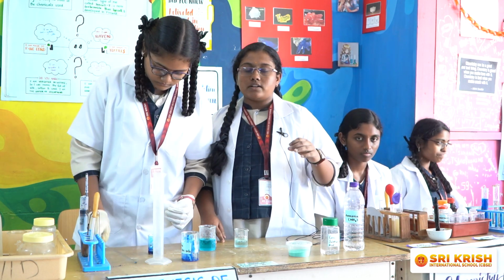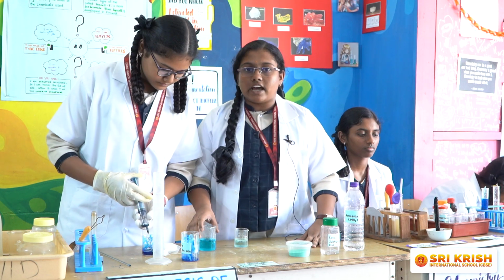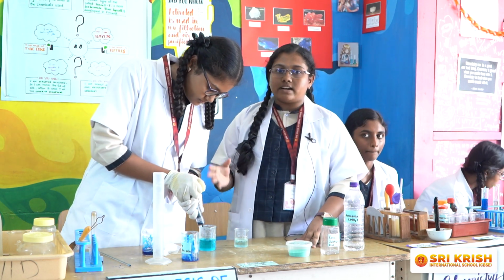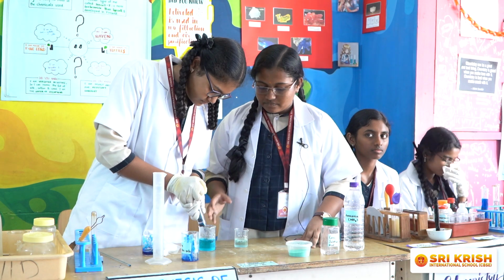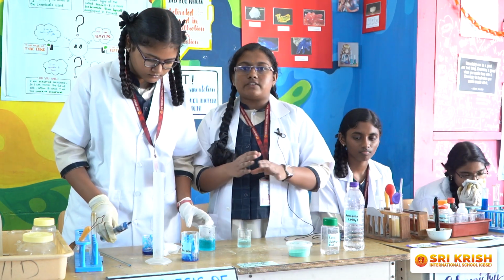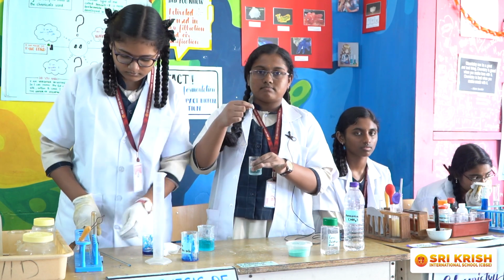Once the cotton wool has dissolved, we take it in a syringe and add it to dilute sulfuric acid. After 5 to 10 minutes, it gives a thread-like structure. It is nothing but the rayon fiber.